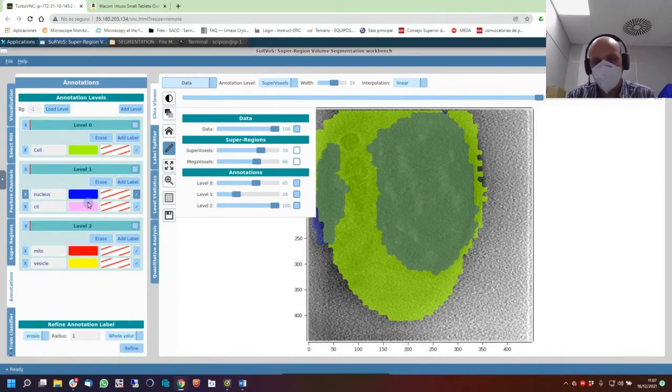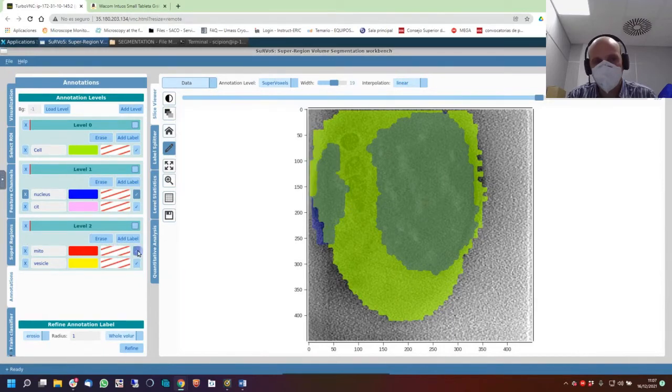But we want to play now with the mitochondria again. Try to click here. Okay. Let's try now smaller stuff.